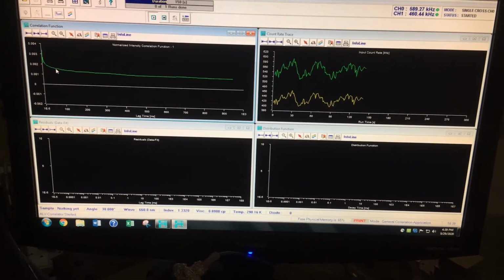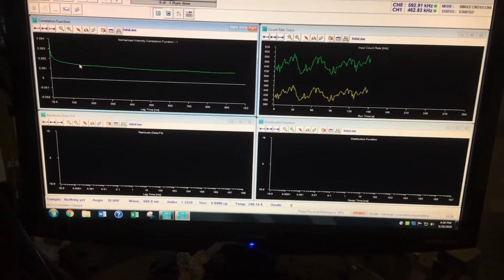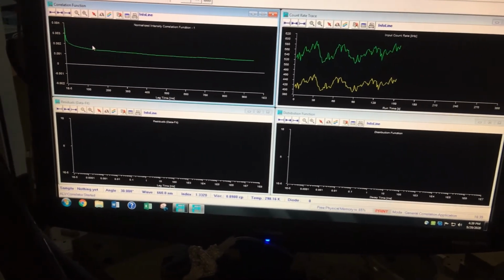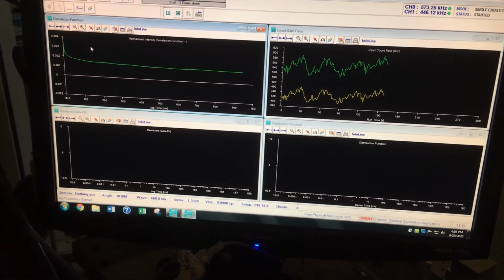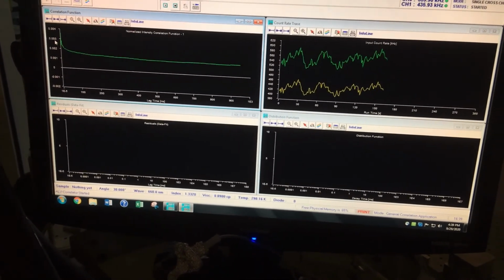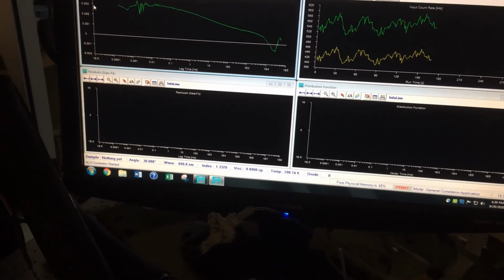Fluorimeter cuvettes that we're using now tend to be birefringent like that. They have other attributes, but they are not particularly stress-free. So that is a depolarized zero-angle light scattering experiment in a nutshell. Let's go back to our time axis here and see how we're doing. Yeah, I bet I could get something out of that.